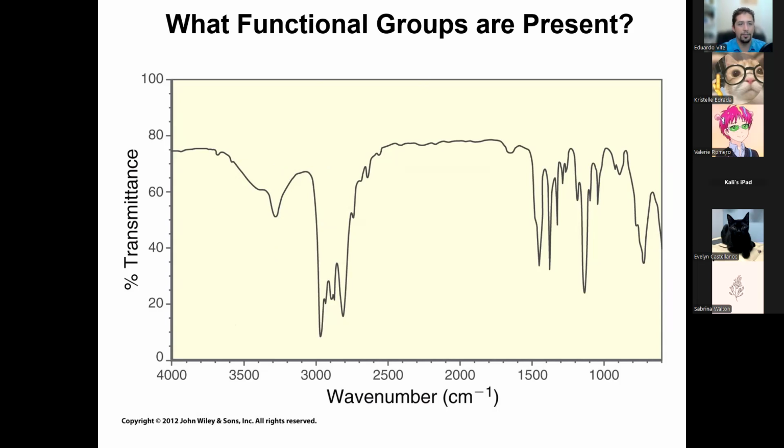So let's see, here we go. This is just NH with two carbons around it. So secondary amine, one NH. What are these right here at 3000? 3000, 2900, 2800. What are these? Alkanes. These are your CH stretches, always there, no matter what.